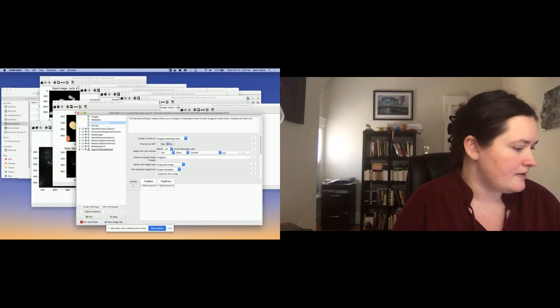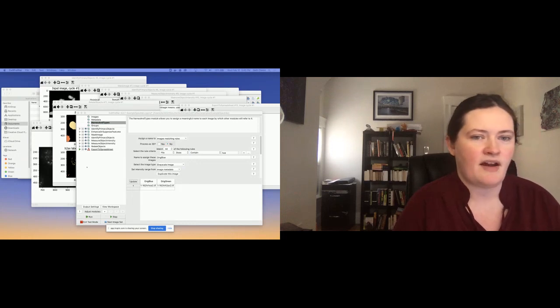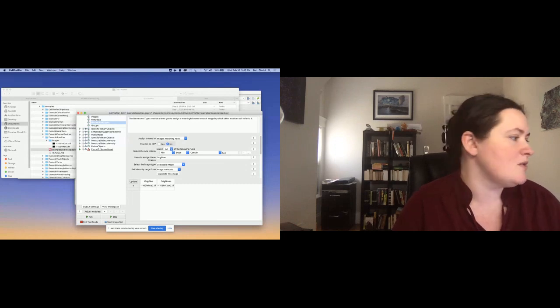All right. So in the last few minutes, I want to talk about measurements. And again, I've talked a lot about how measurements are really important. I just want to talk a little bit more about some of the reasons that we really try and make measurement handling so easy.